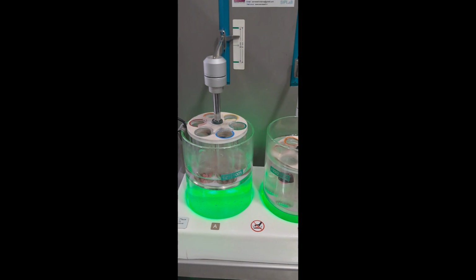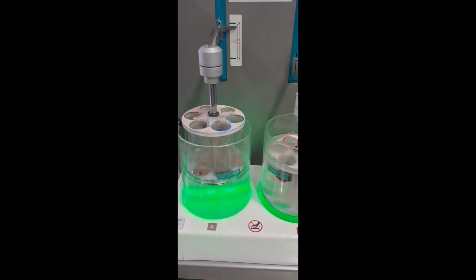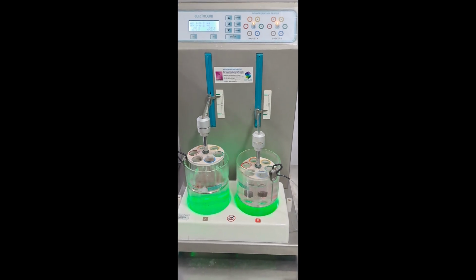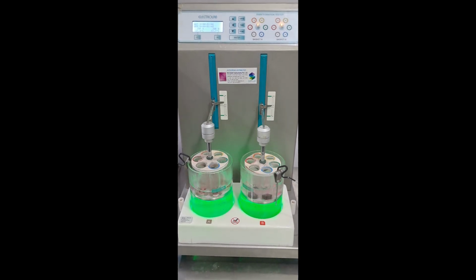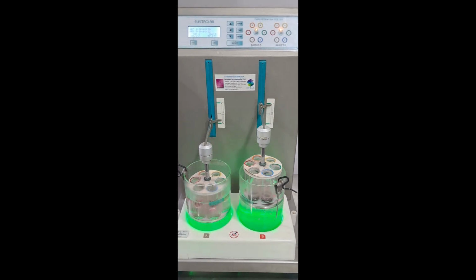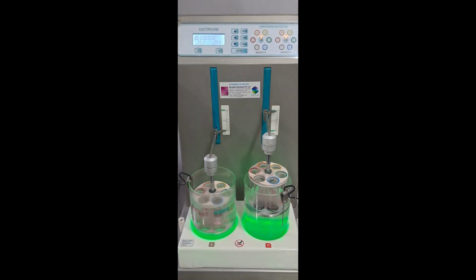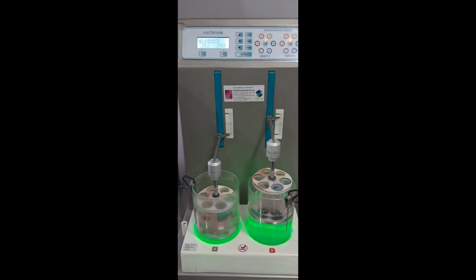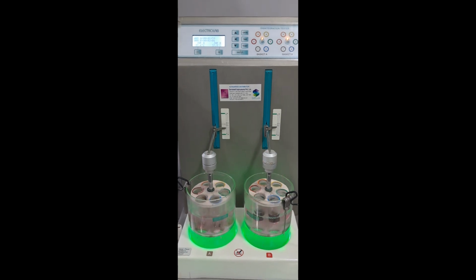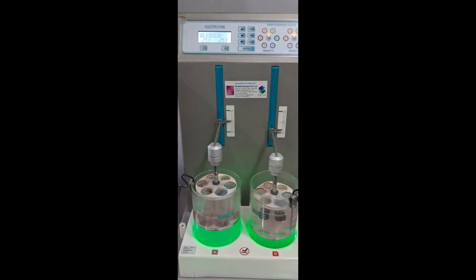Chewable tablets. These are designed to be chewed, not to disintegrate in a liquid medium without mechanical action. Parenteral preparations, injections. These are sterile solutions or suspensions and do not undergo disintegration. Topical preparations, creams, ointments, gels. These are applied externally and do not disintegrate internally.